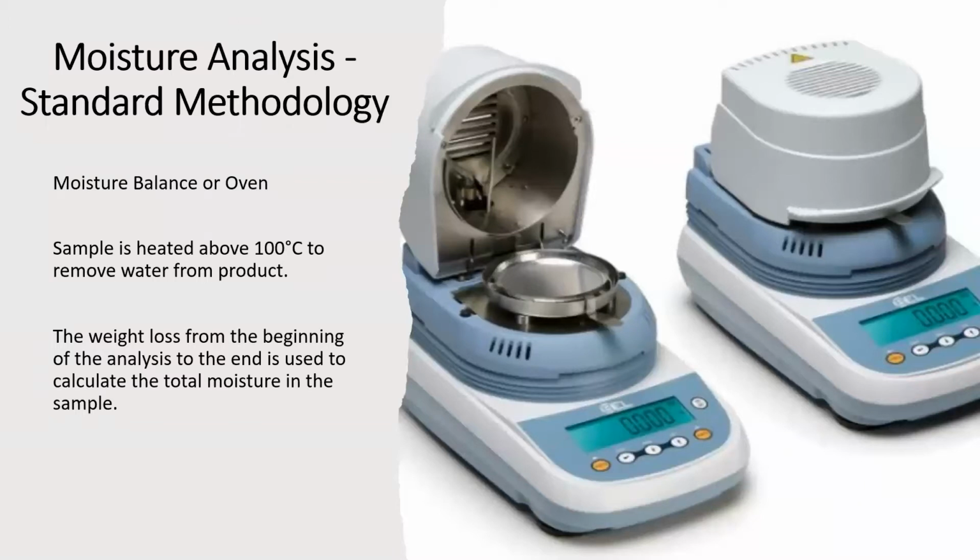Before we get into the various nuances of dry weight corrections, let's discuss the standard method for moisture in cannabis. Currently, most laboratories and even some growers use a loss on drying method to determine the water content in cannabis flower. This is done using either a moisture balance, like the one pictured here, or a basic laboratory oven that can heat the samples up. Ultimately, a portion of the sample is weighed and then placed into either an oven or moisture balance that will begin heating the sample. Once the sample has been heated for the designated amount of time, the sample is weighed a second time, and the total weight loss will determine what the water content in the sample is.